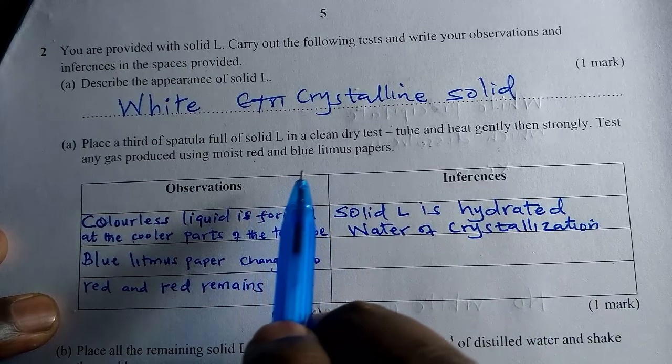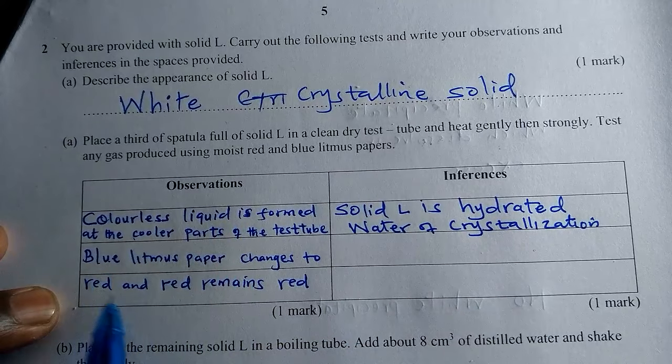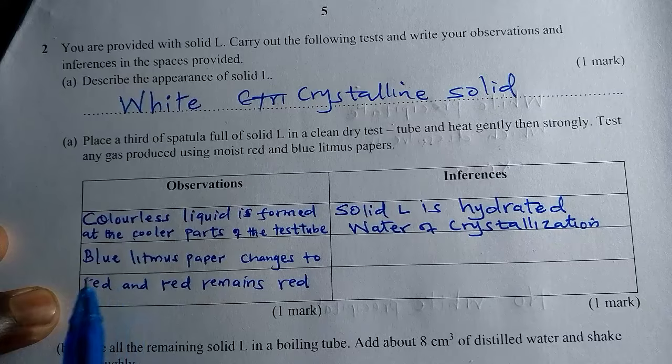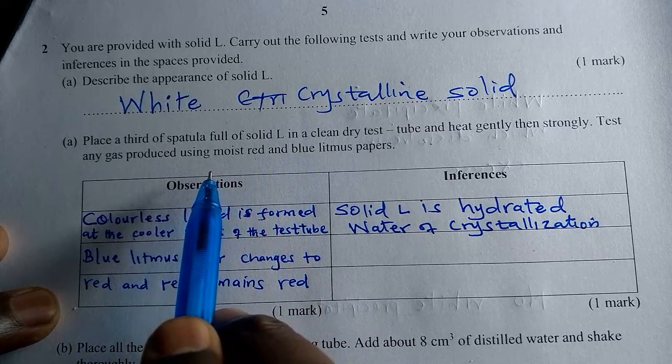Then what will happen to the litmus paper? Red will remain red. Blue litmus paper changes to red. So if blue litmus paper changes to red, what changes a blue litmus paper to red? It is an acid. So it means the gas that was produced is an acidic gas.